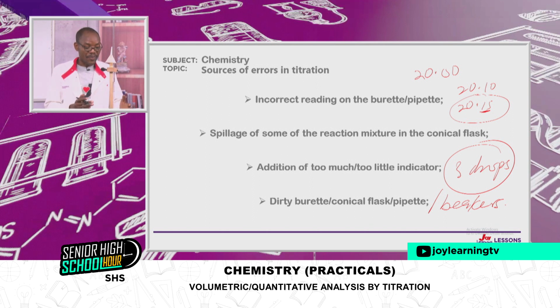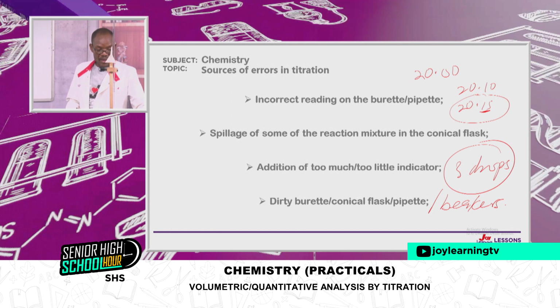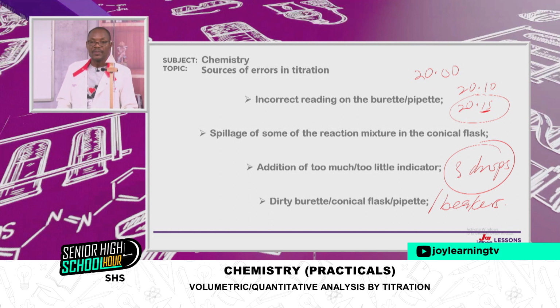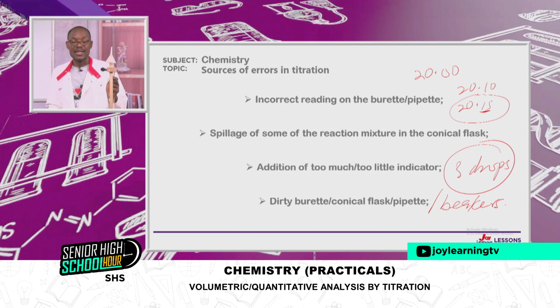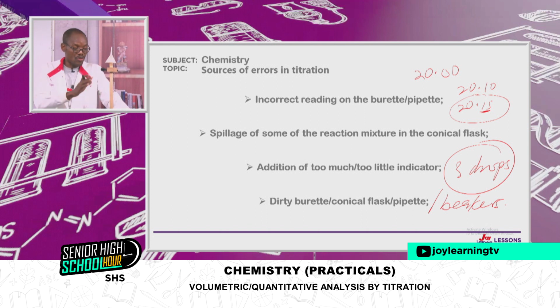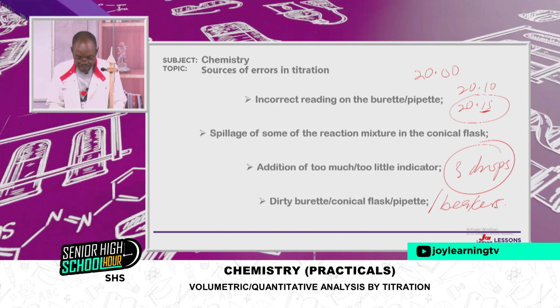They must be clean. At this stage, you don't do much of the work. The lab technicians or your instructors will clean everything for you. So when you come into the lab, you only rinse inside. And also rinsing inside is a way of removing any contaminant from the apparatus that you need for the process. So it's very, very important. Anytime you want to use them, make sure everything is rinsed before you use them.